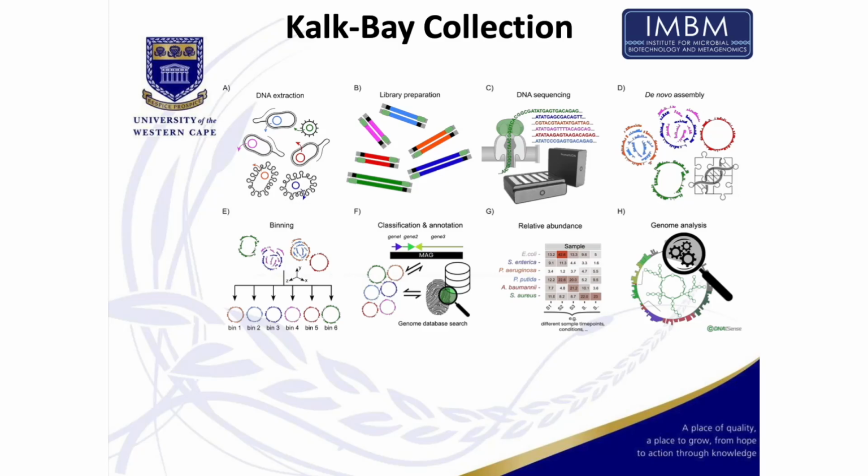Then we do binning. This is the magic of trying to separate out the genomes. And then we can go on to run through those tools that I just described. Do I have a novel bug? What pathways does it encode? So on and so forth.